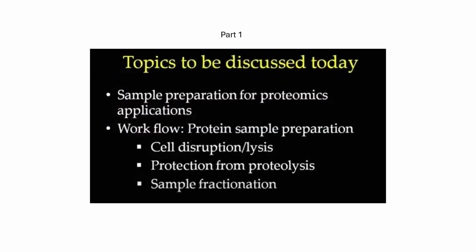So protection from proteolysis is also essential, and as soon as you lyse the cell, it has everything. It has DNA, it has protein, it has RNA. You need to make sure that all those are separated, no contaminants are present, and you just want the protein to be analyzed, right? And in that protein fraction also there will be all sorts of proteins present.